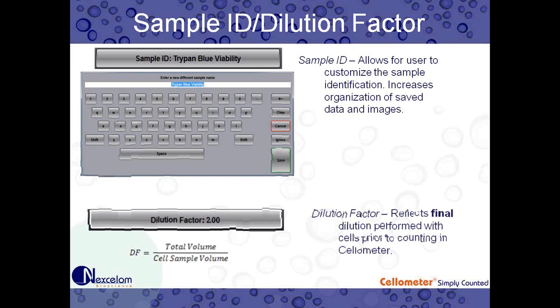So next, there's also the auto-saving feature found in settings in the home screen. When it's turned on, it allows the user to save to a specific folder and to generate data reports. This ensures that your samples are saved to the right place every time, and it allows the user to quickly go through a series of samples.